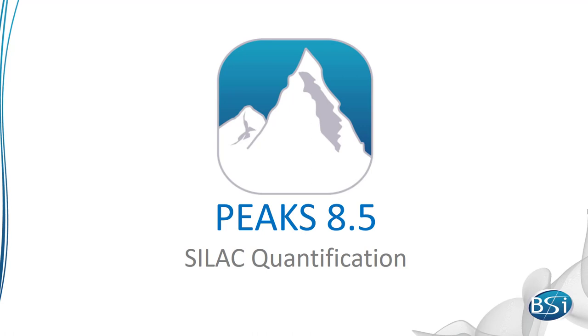The PEAKS-Q module has an intuitive, accurate, and sensitive approach to SILAC quantification.